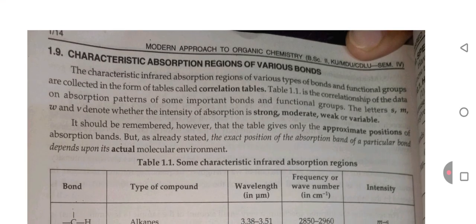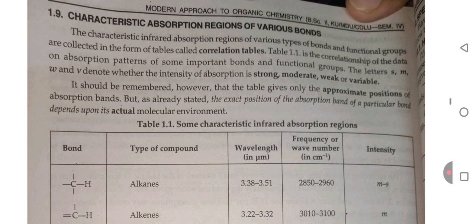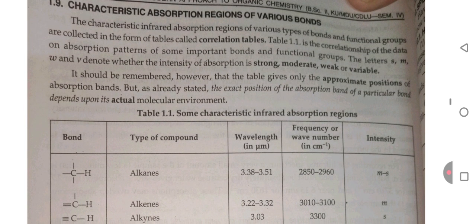Characteristic absorption region of various bonds. The characteristic infrared absorption regions of various types of bonds and functional groups are collected in the form of tables called correlation tables. Table 1.1 is the correlation data on absorption patterns of some important bonds and functional groups. The letters S, M, W, V denote whether the intensity of absorption is strong, moderate, weak, or variable.